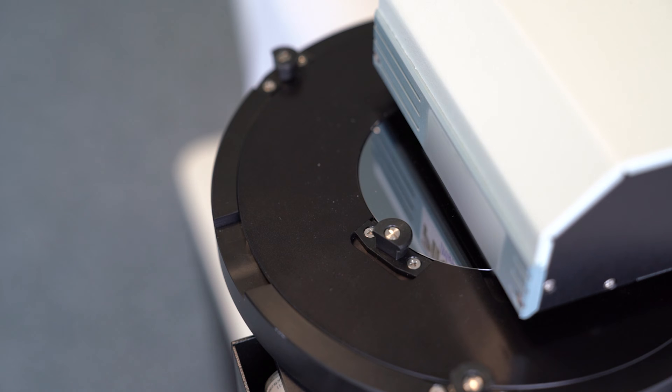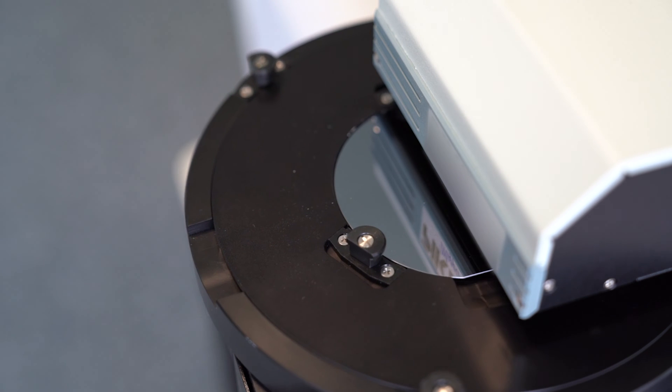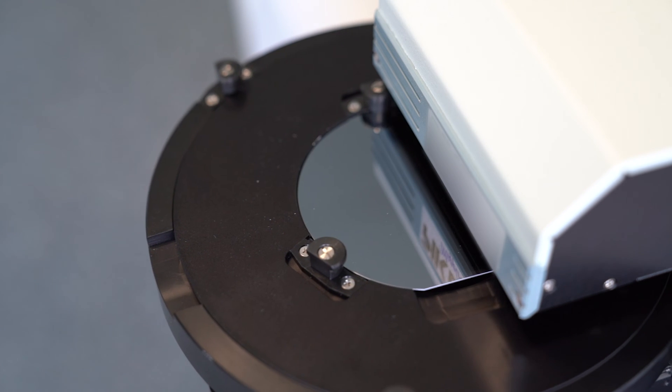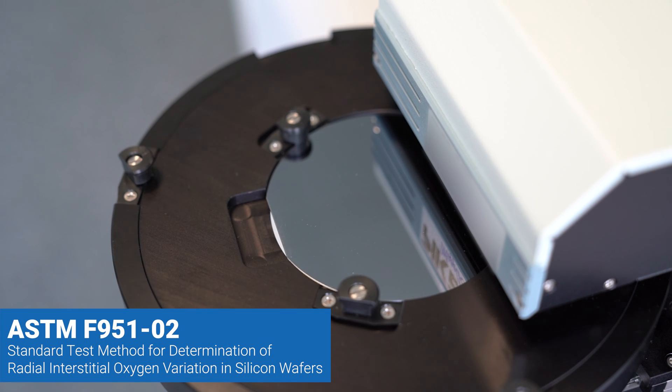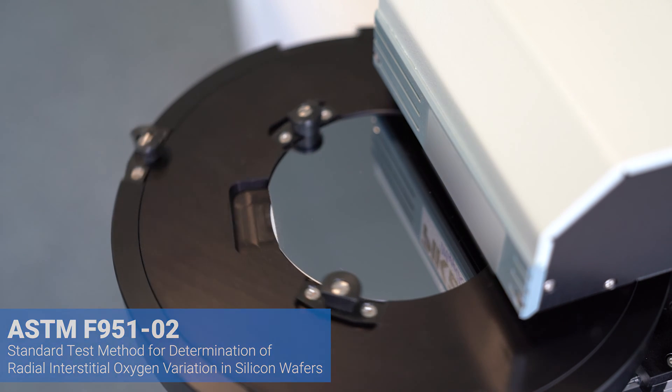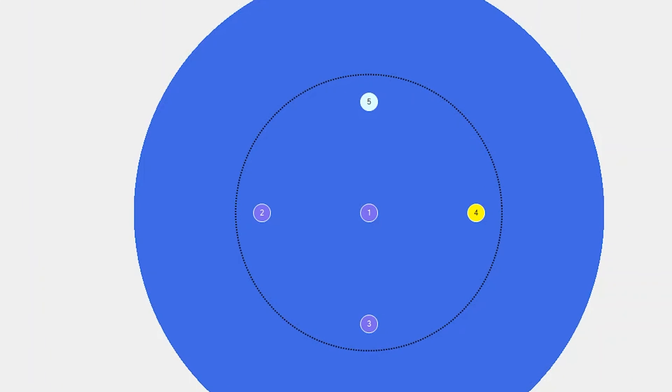The Map IR will automatically move the wafer between testing points in accordance with ASTM F951-02.